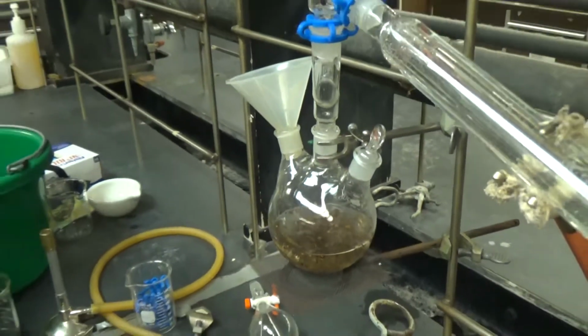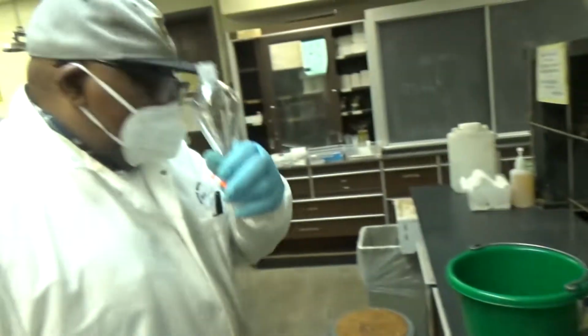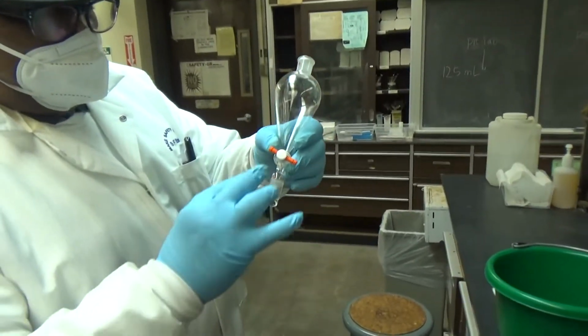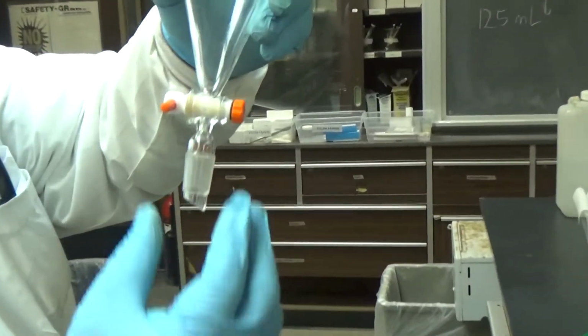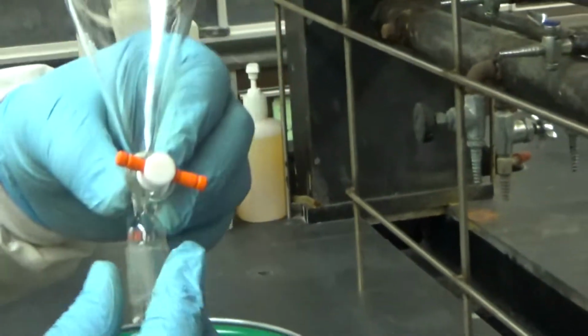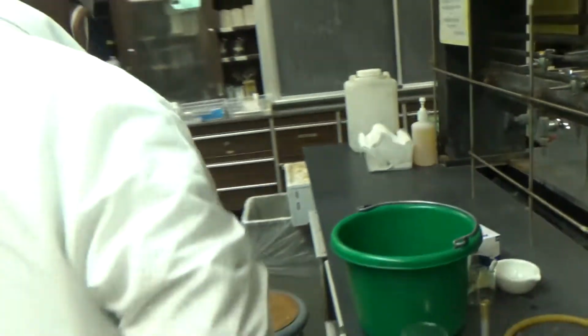All right. Now the next step, I'm going to add some water into the separatory funnel. You need to use the separatory funnel with a big tip, with the ground glass joint, because otherwise it wouldn't attach. Some of them don't have that. This one is called the male glass joint, and that's the female ground glass joint. Got it.